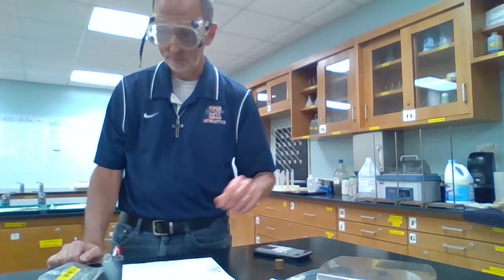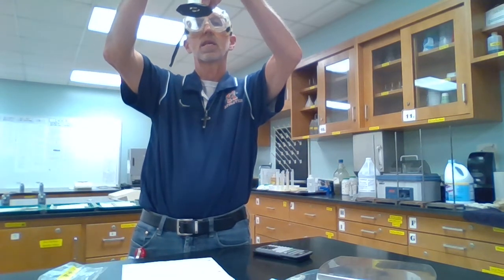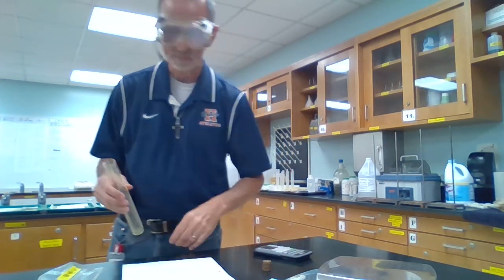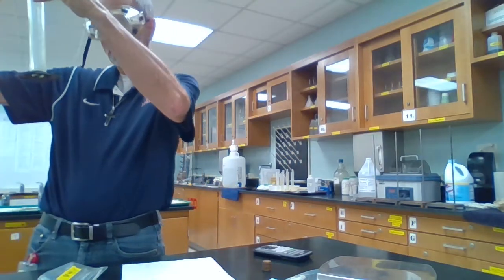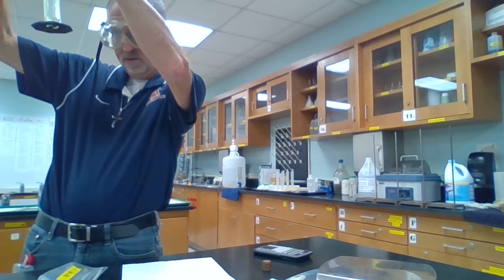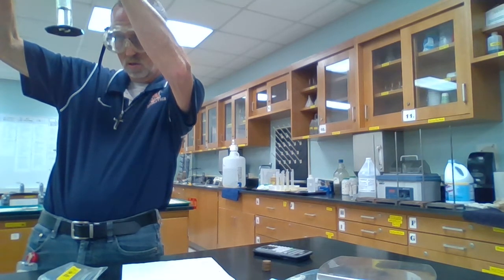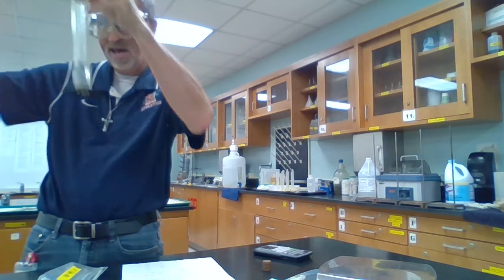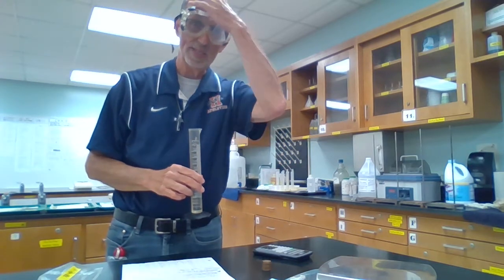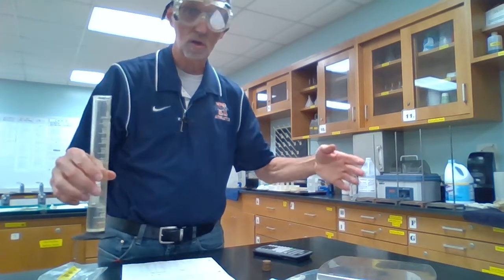Now we'll do the volume. So I'm going to need some water. See how many pennies that is. So I'm going to need at least about 12 or so mLs of water. I'm going to probably go a little more than that just to be safe. See if I can stop it on a line here. That'd be nice. Oh, not bad. All right. Well, I stopped it right on 20, but again, smallest marking's the ones place, so we got to go a decimal to the tenths. So 20.0 would be my volume I'm going to work off of.